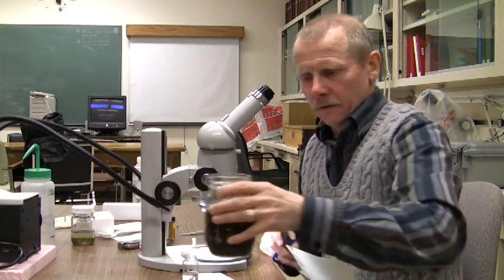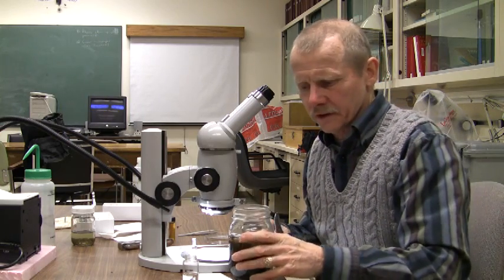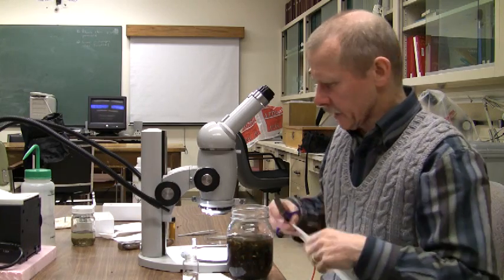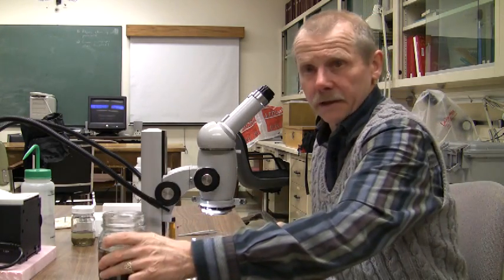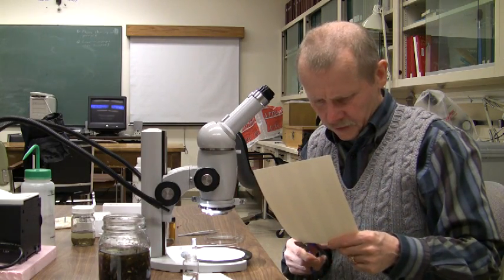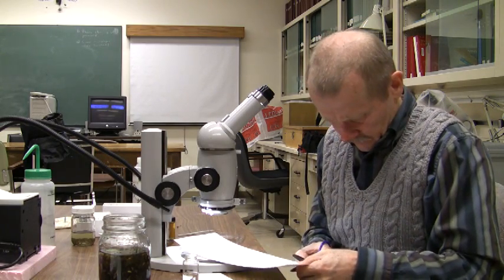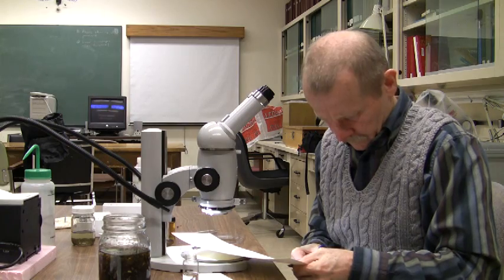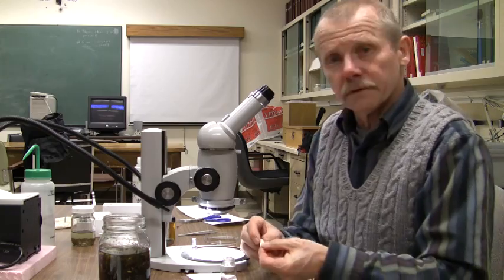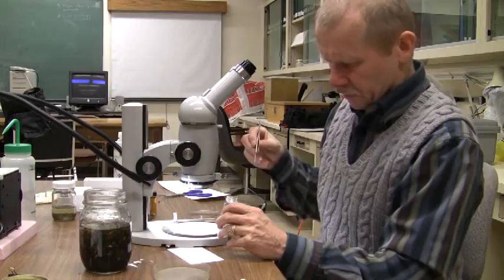Now we're going to start dealing with some of the smaller insects, and these will need to be sorted. These haven't been pre-sorted for you as some of the larger insects were. The first thing to do is to get a label for those specimens. What we do is just cut a small number of these off this strip and put this label in a vial of 80% alcohol.